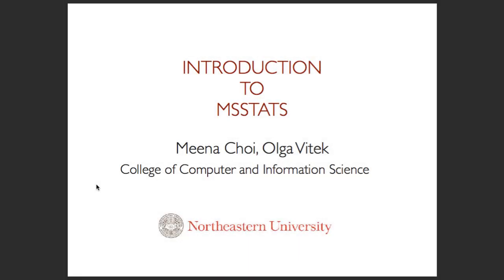So what we would like to do in these 2.5 days is to focus more on the type of statistical methods which we would need specifically when working with quantitative mass spectrometry and proteomics. Those of you who were not here last week, we spent the first 2.5 days talking about how we can process raw data using platforms such as OpenMS or Skyline, and we can come to the point where we have a list of identified and quantified peaks.